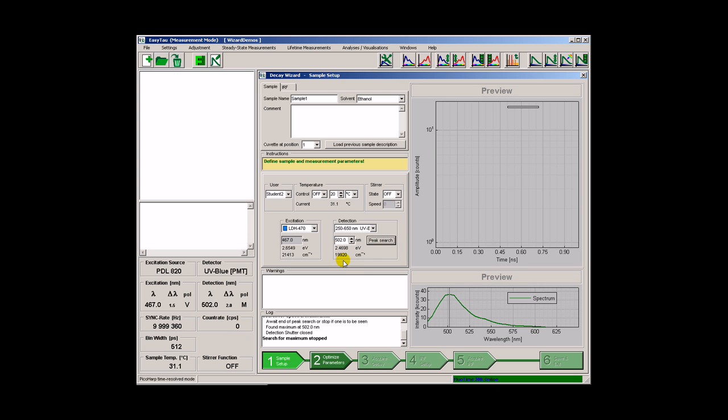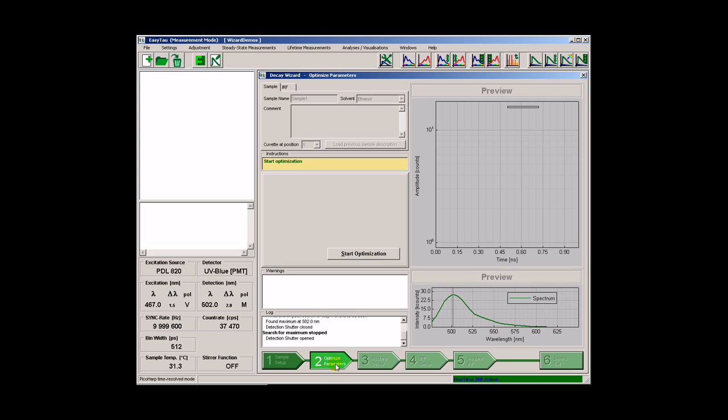At this moment we are ready for the next step. This optimizer tries to find the best hardware settings for a measurement of a correct and complete decay curve. This is not a simple task. Several factors have to be taken into account including the laser repetition rate, the temporal bin width of the TCS PC electronics and the signal count rate.